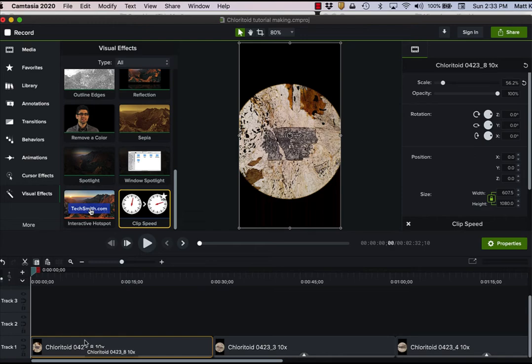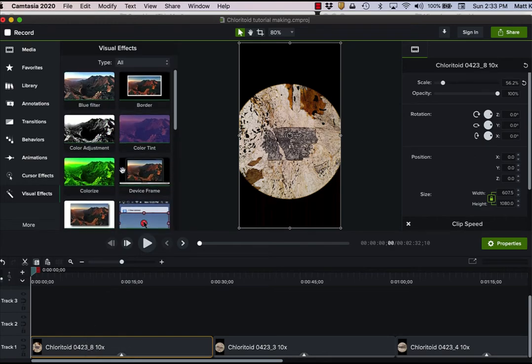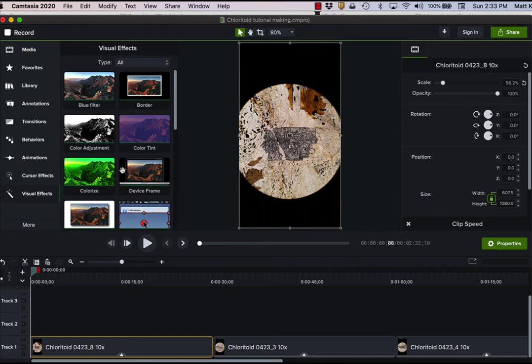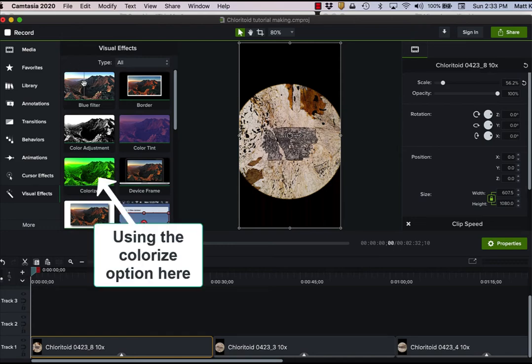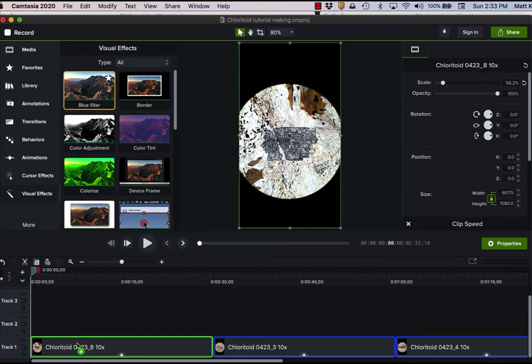Now, there can be some difficulties with my phone, or really with any microscope, with the color balance. And so there are a couple possibilities. One is that if it's not doing the blue filter correctly, I created a blue filter. So I'll show you what that looks like if I drag this blue filter onto here. Then it brightens everything up.